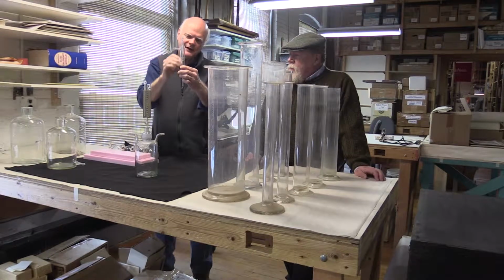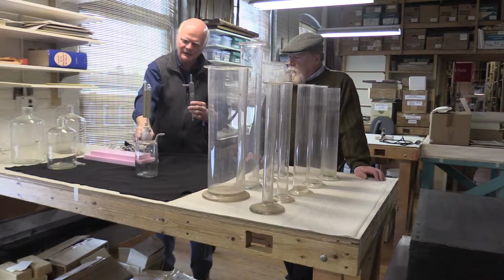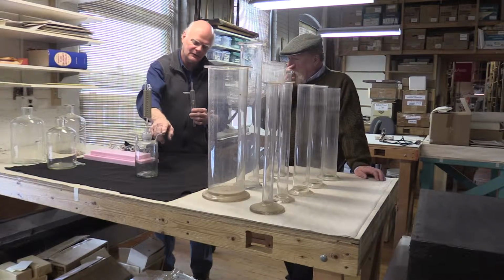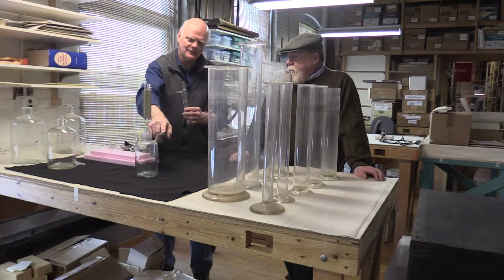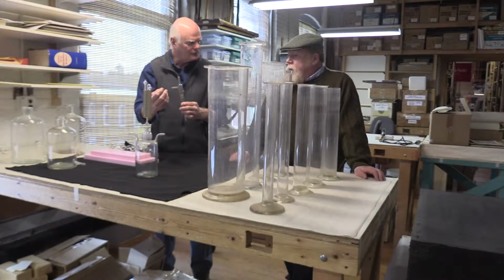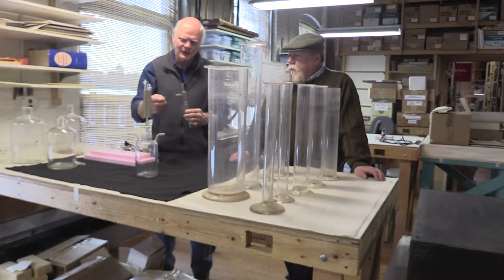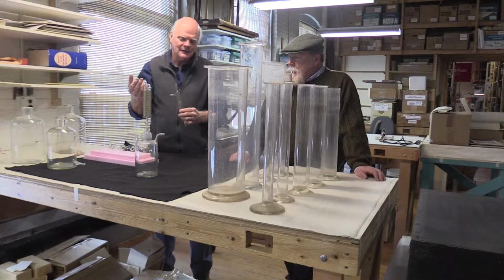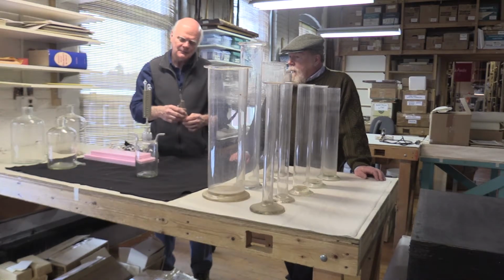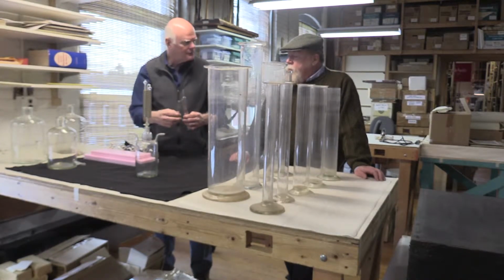So you can see bubbles of air go by. So you hook this up to this, close this side off, draw the air out of that. The manometer would measure the drop in pressure, and then you would hook this up to a number of devices. You could hook it up to the still head for distilling an organic compound at a lower pressure, so you didn't have to heat it up as much, in which case you wouldn't distort the organic molecule itself. Borden did that with vacuum evaporation in making condensed milk, evaporated milk. Or you could hook it up to a filtration apparatus to pull the liquid through the filter paper.